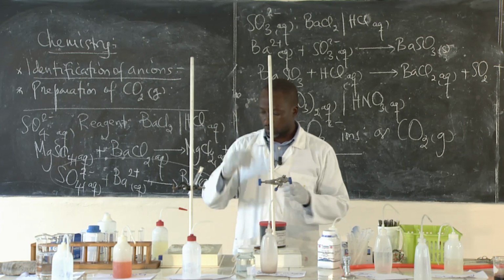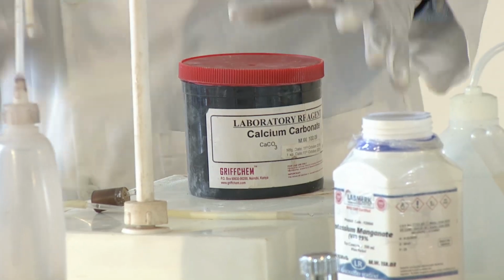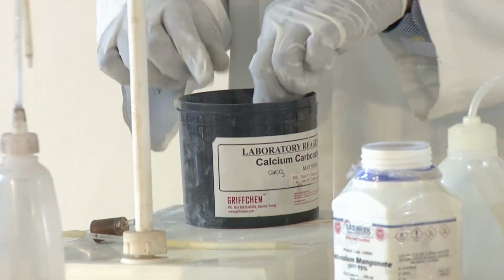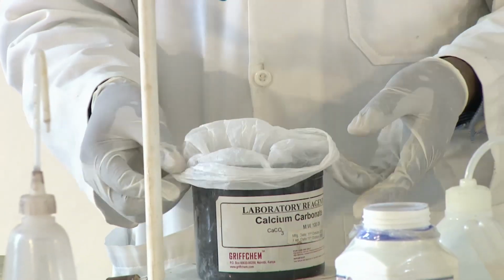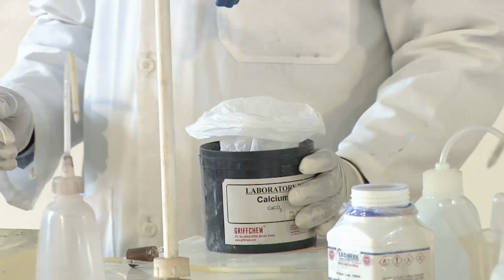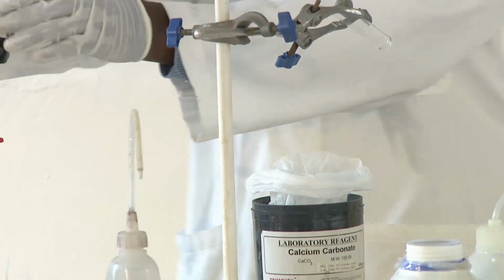So what we're going to do is prepare that carbon dioxide and then test that carbon dioxide. How is it tested? This is calcium carbonate powder.